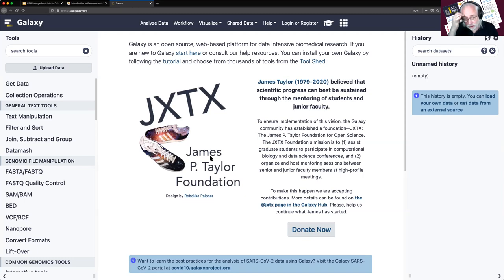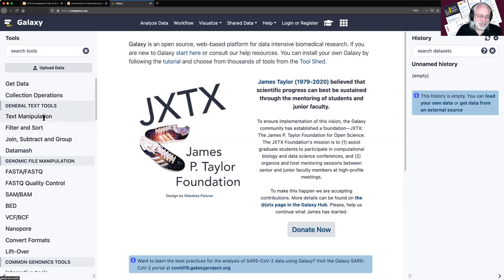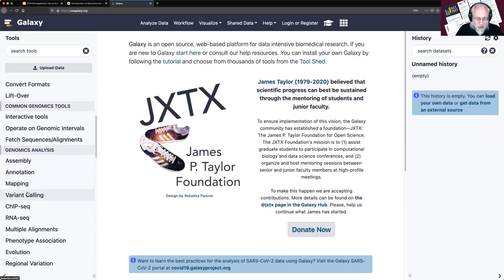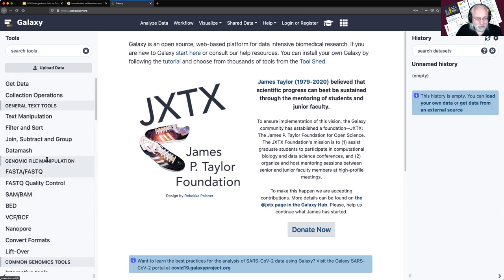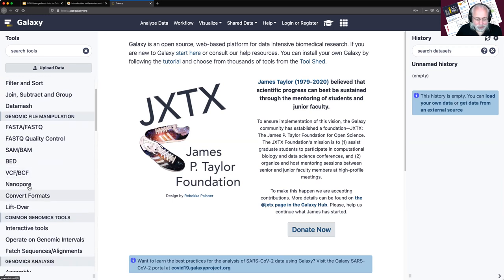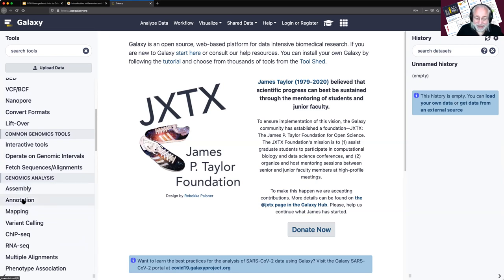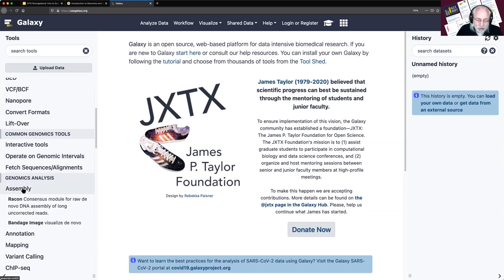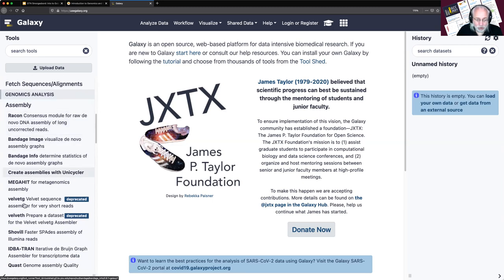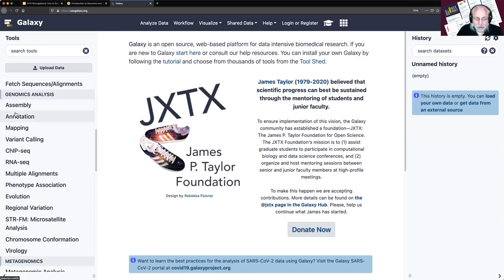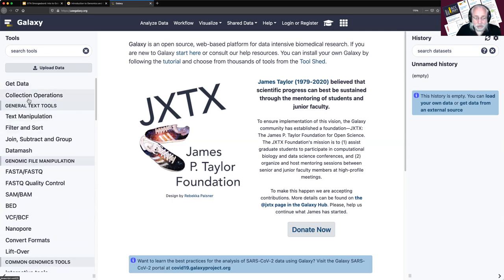This is usegalaxy.org. Galaxy has a three-panel design. On the left is the tool panel, with a series of toolboxes containing related tools — some basic stuff like get data and text manipulation, but also specific things like variant calling, mapped data, SAMBAM, genome assembly, and genome annotation. Lots and lots of tools. If you click on any of these, it expands to show you the tools that are there.